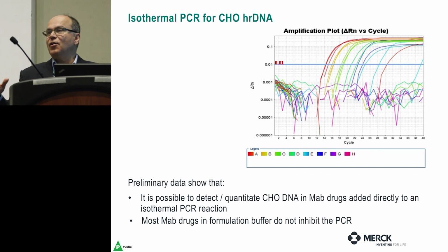So at the end of the process, if we were to do this, and I've done this, we'll get two phases, water and oil. Droplets are made, but if we subject them to thermocycling, I think the PCR reactions are going, but it's separating into two phases, which is no good for us.